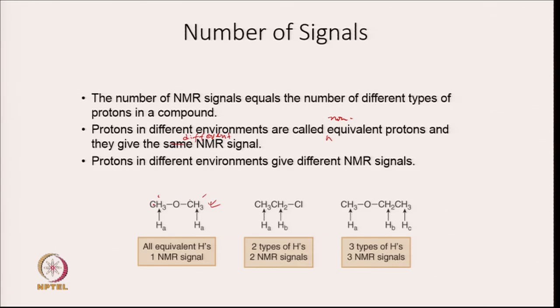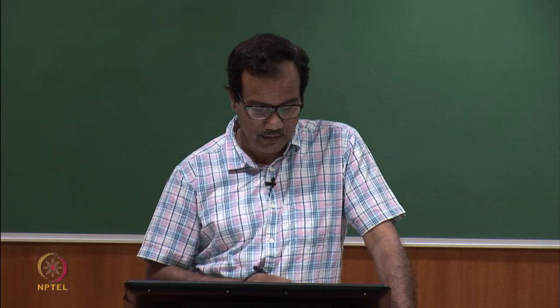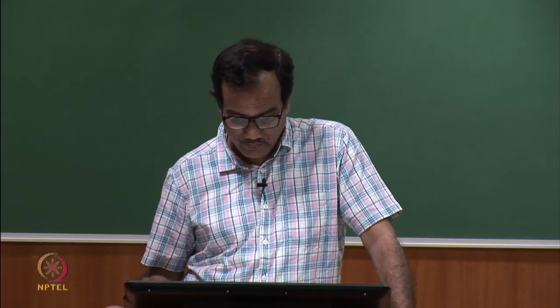So the environment of any proton in dimethyl ether is the same. The protons have only one kind of environment, so you will get one NMR signal.